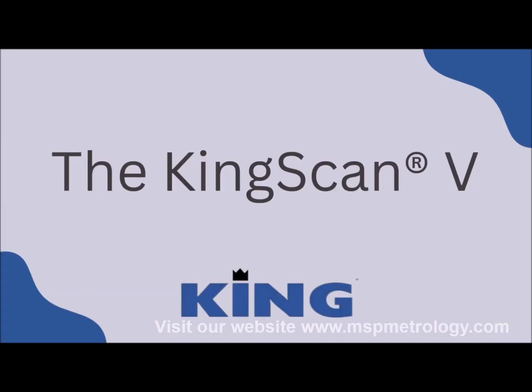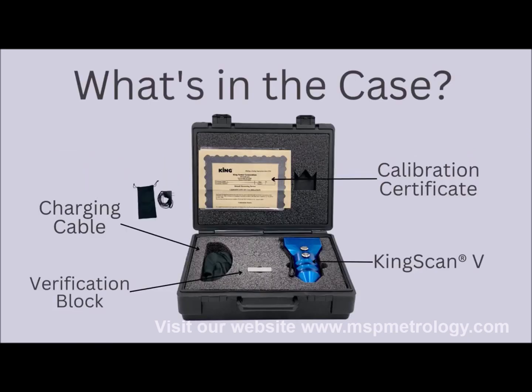We are going to do a demonstration of the functionality of the KingScan 5 from KingTester. The KingScan 5 is menu driven with an easy to follow intuitive graphic user interface. It is an ASTM-E10 Type-A microscope and has a new ergonomic design that features a rugged metal housing.